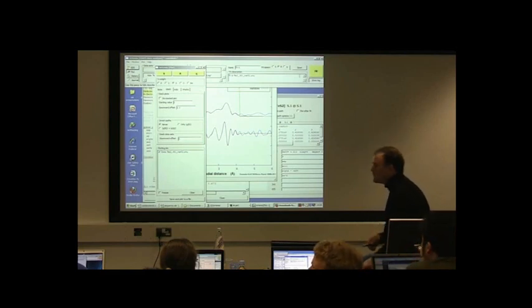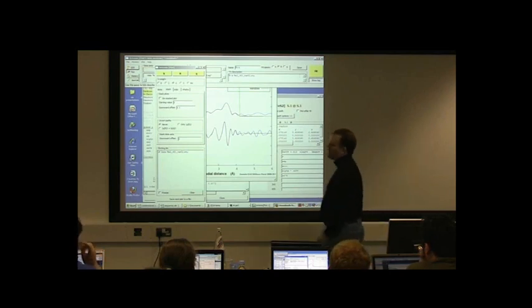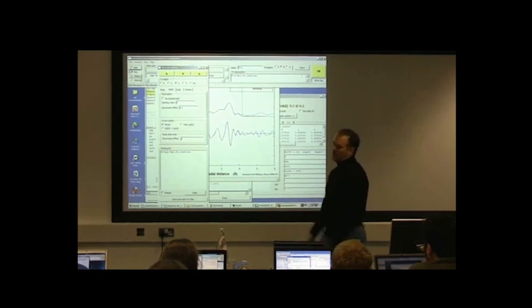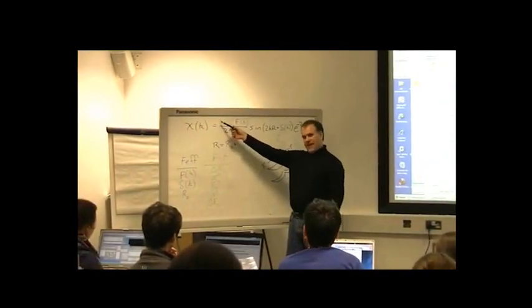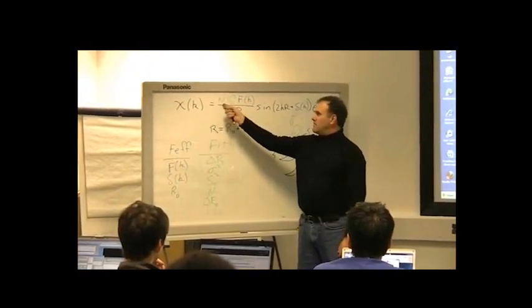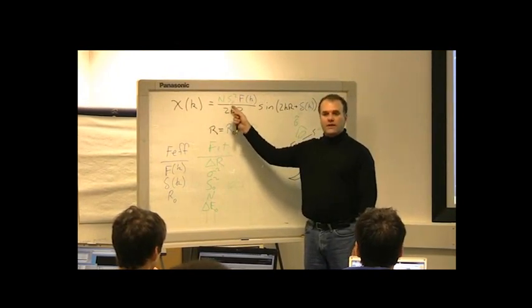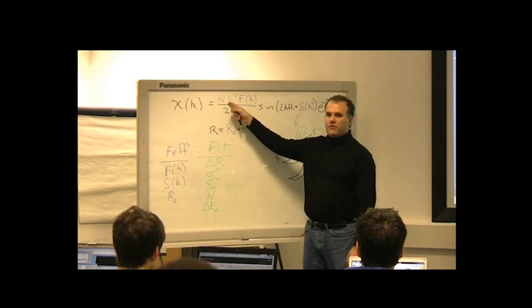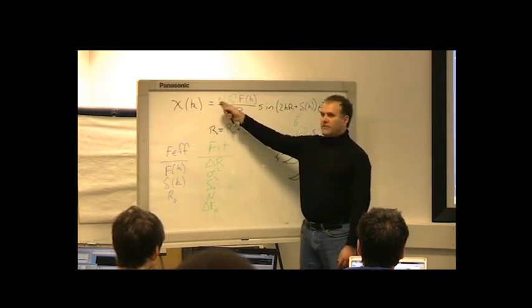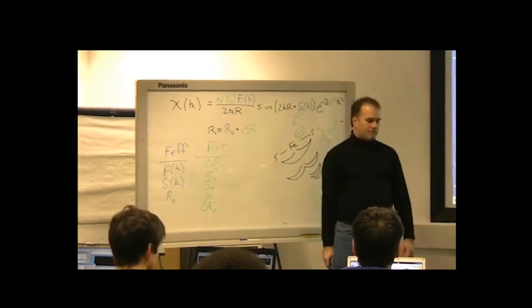More or less. There's two problems with that. One is that, imagine back to the single scattering problem where we have just one path and we're trying to evaluate this equation. If n is something you're trying to get out of the data, you can't measure these two numbers independently because they're multiplied by each other. They are 100% correlated. I'm sorry, they're minus 100% correlated. If this is supposed to be 12 and this is supposed to be 0.9, you get the exact same fit if this is 120 and this is 0.09. These are completely correlated.